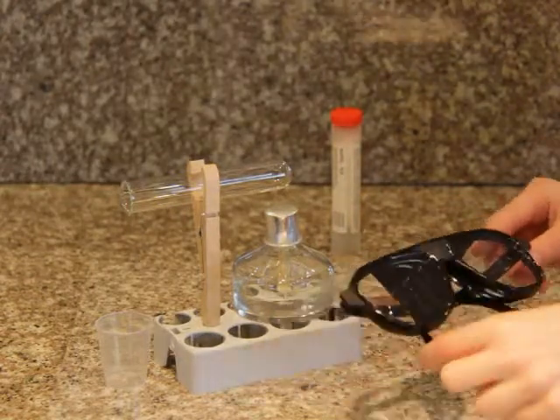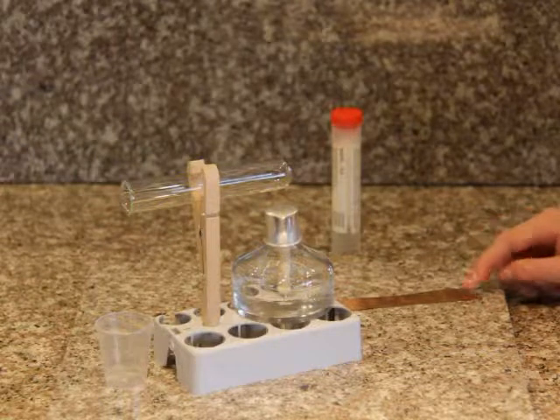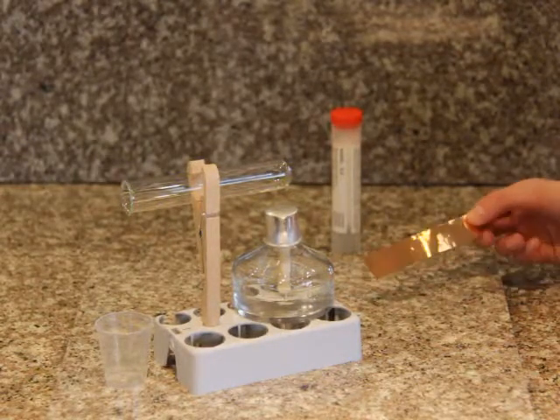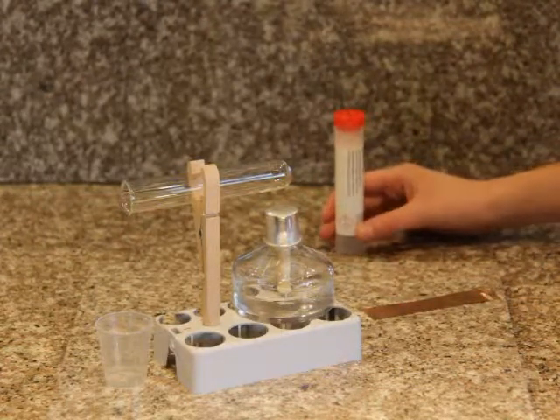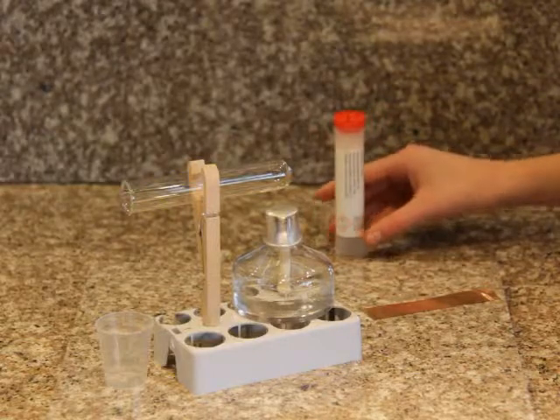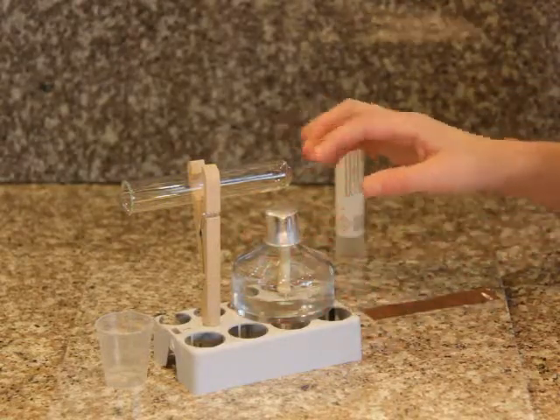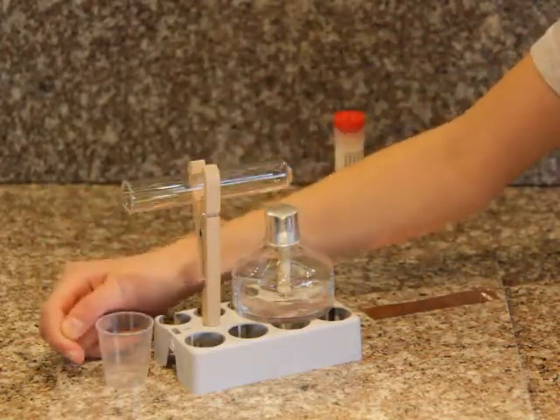To do experiment number 10, I will need my safety glasses, a 1 by 1 centimeter piece of copper from this sheet, sodium hydrogen sulfate, the alcohol burner, test tube, test tube stand, test tube holder, and a small graduated beaker.